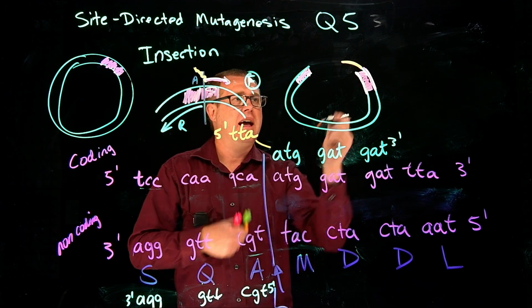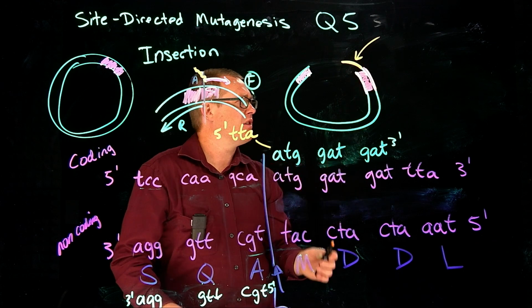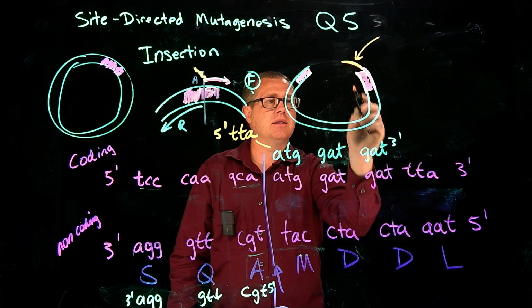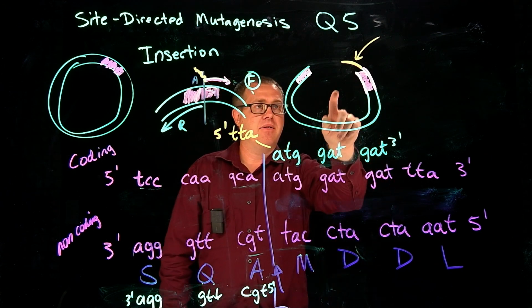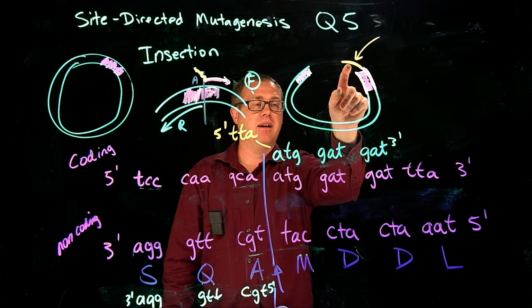And so that is the insertion right there. That should be color. I don't know if it's contrasted well enough on your end, but this is the orange part, and there's the gene. And so that's what we have. We have this overhang right here at this little DNA right there.